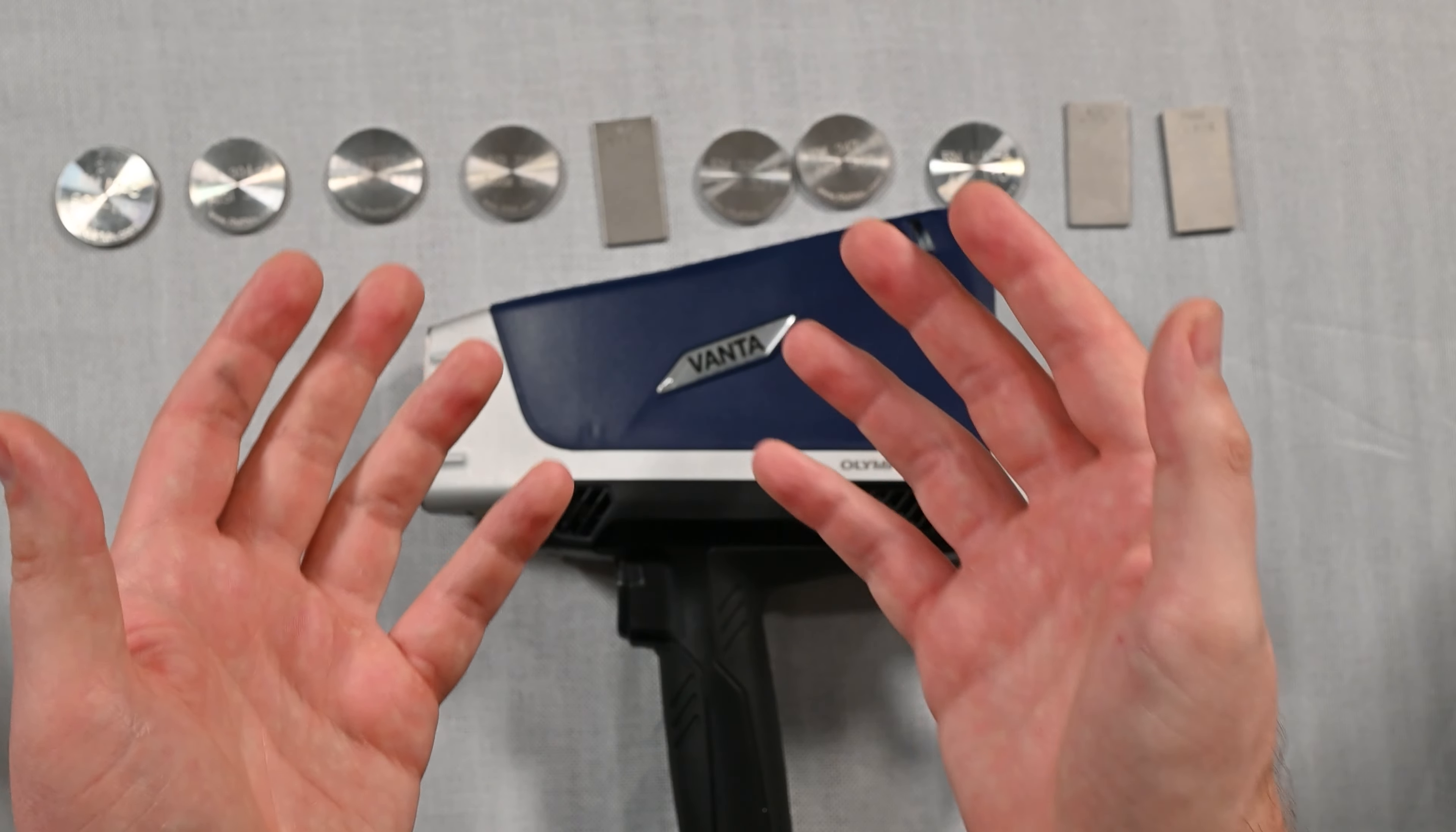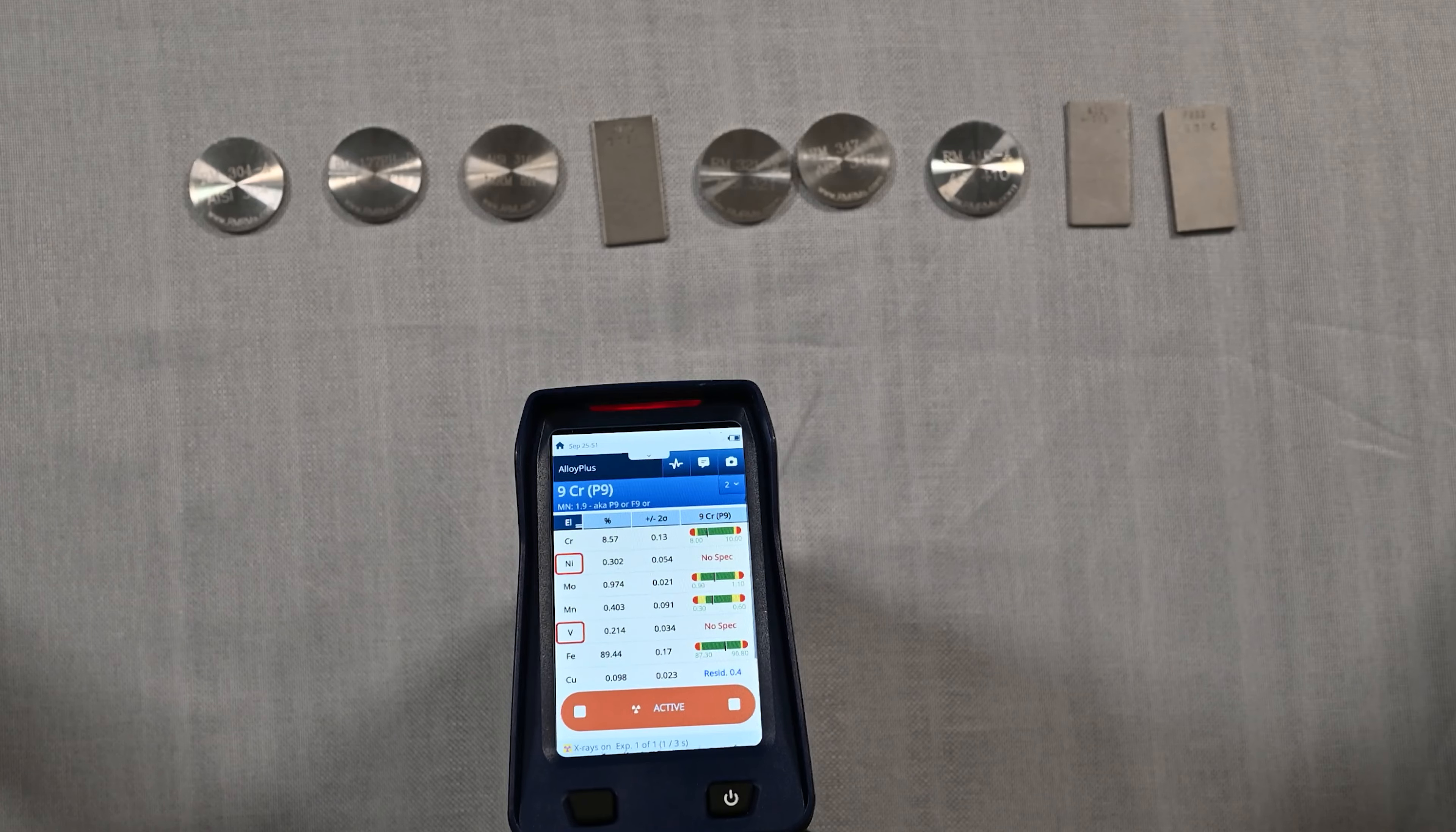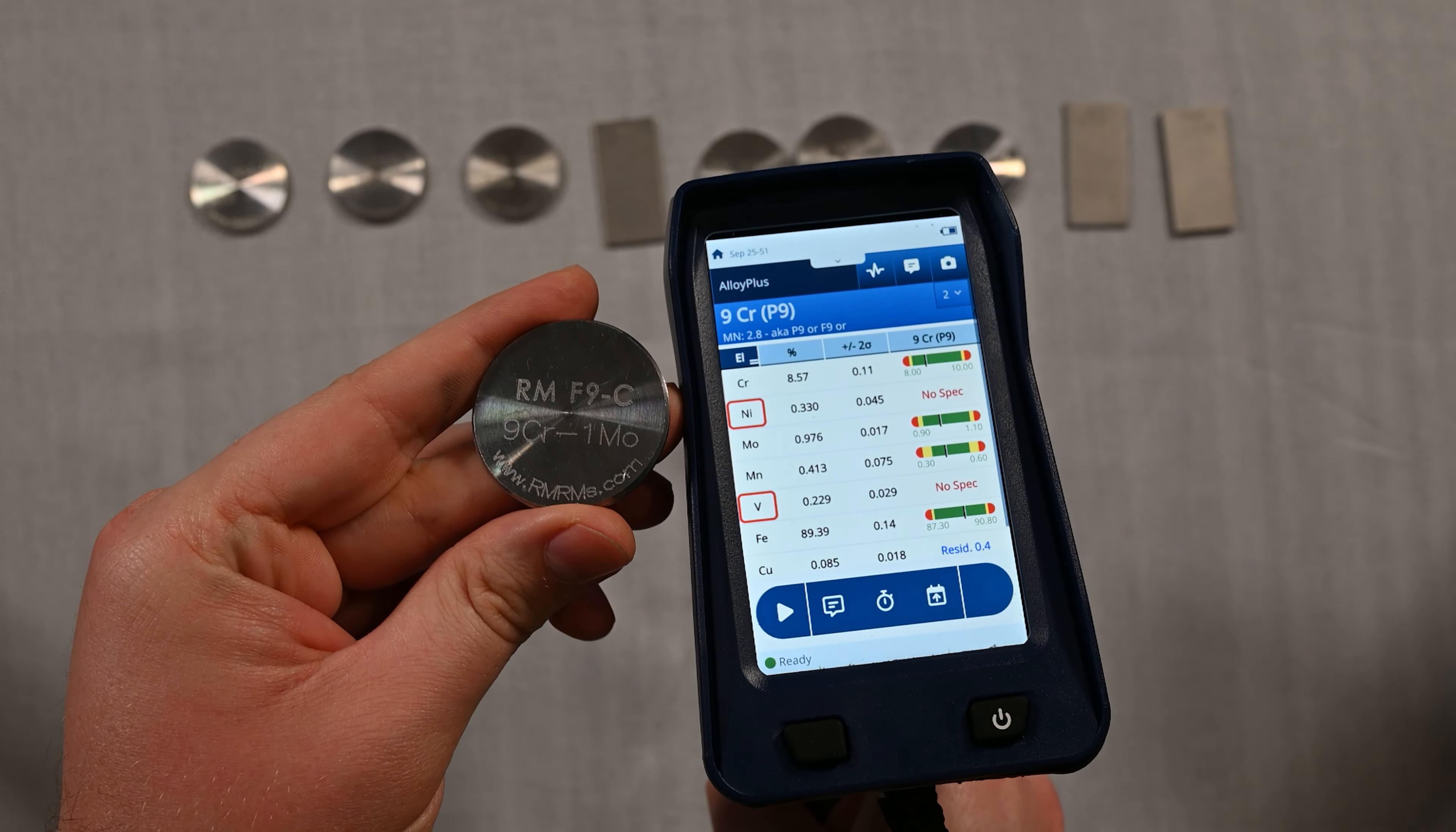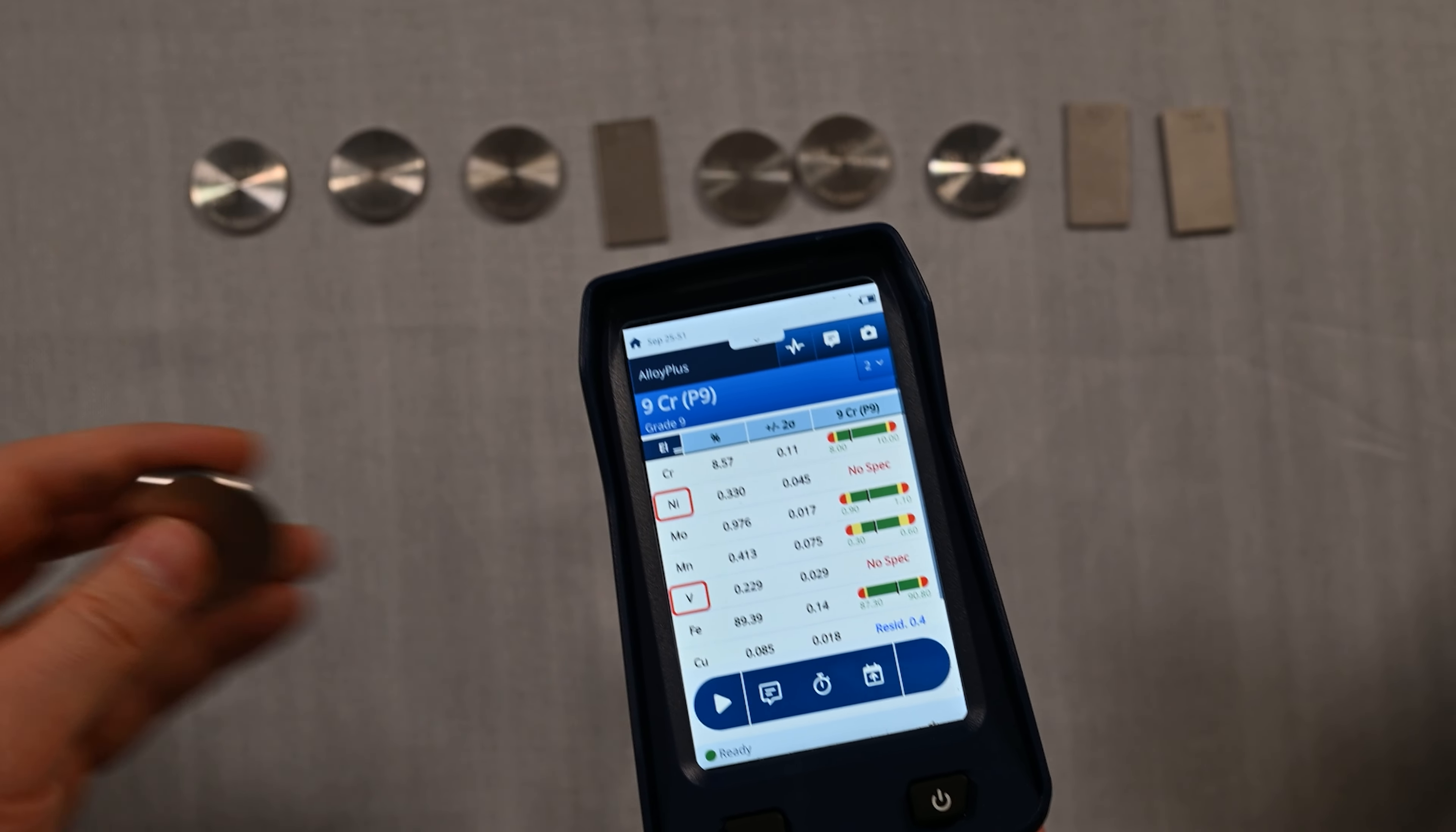Let's start with a lower alloy sample here. We'll just approach the sample and push the trigger one time and let this analyzer work. Remember there's a smart sort here which is going to configure the x-ray beams for us. We have a sample called 9 chrome 1 molly and we were able to identify that with no problem. You'll see that the nickel is very low and the chrome isn't quite over that 10.5% threshold for a stainless steel, but it's still a corrosion resistant material.